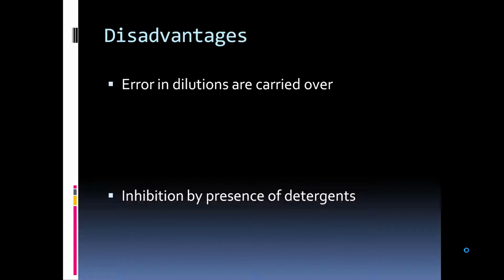Using the Bradford assay to determine unknown protein concentrations also has its disadvantages. Since the plot of the data is linear over a short range and it often requires making dilutions of samples before the analysis, the error in one dilution is carried over in further dilutions, which results in a linear relationship that may not always be accurate. In addition, the assay can be inhibited by the presence of detergents such as SDS. However, this problem can be lessened by the addition of cyclodextrins to the assay mixture.